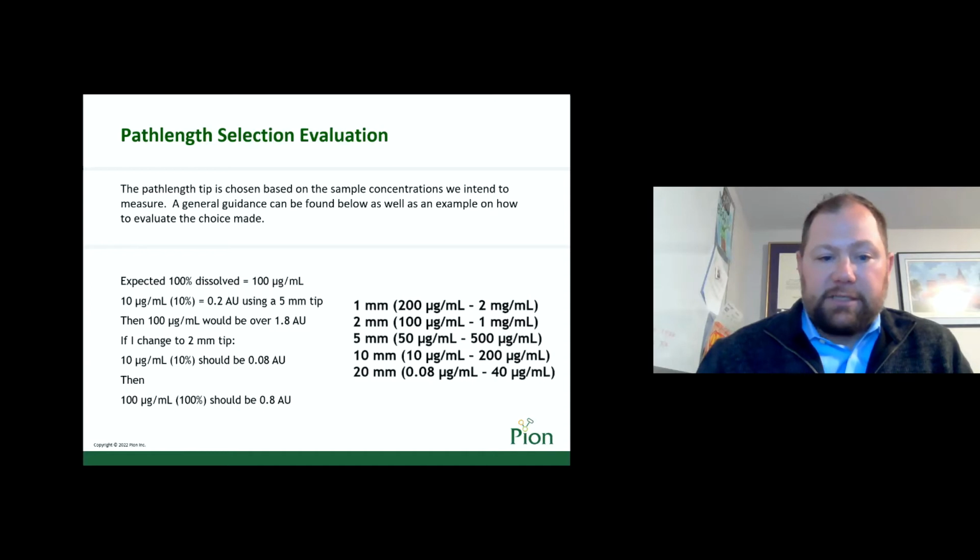It is preferred where possible to have the absorbance of my final concentration solution be between 0.5 absorbance units and 1 absorbance unit. This is below the upper limit of the instrument, but keep in mind scattering further decreases transmittance, thus increasing absorbance. In highly turbid environments, you may also consider reducing the path length to get the absorbance below 0.5 absorbance units. Keep in mind that we will work as far out in the absorbing region as possible using second derivative, but we will discuss that in more detail shortly. For now, I use direct spectra and a shoulder or peak max to assess spectral quality.